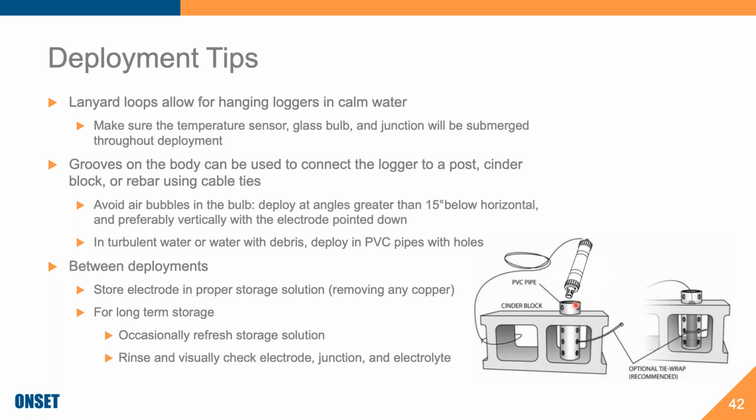Another option, if you're storing it for an extremely long time, one option I've seen recommended, and I'm not 100% sold on it, is to store it dry, meaning you just take your electrode out of any storage solution.